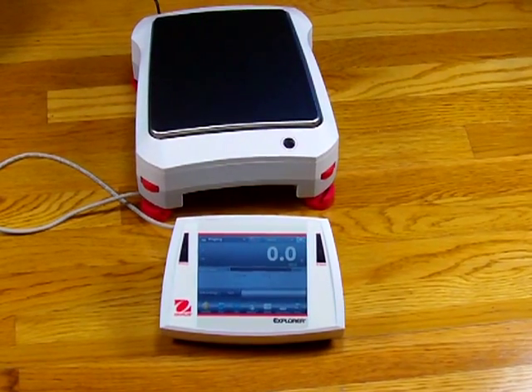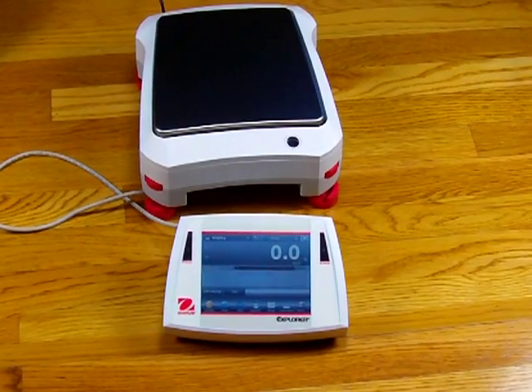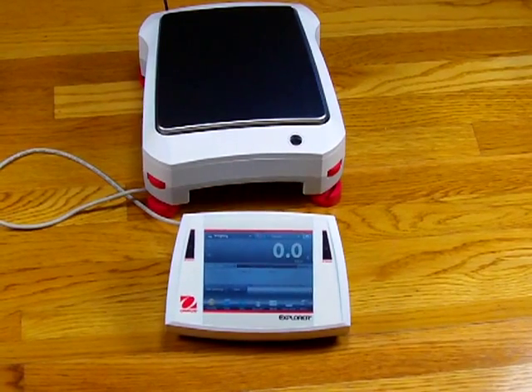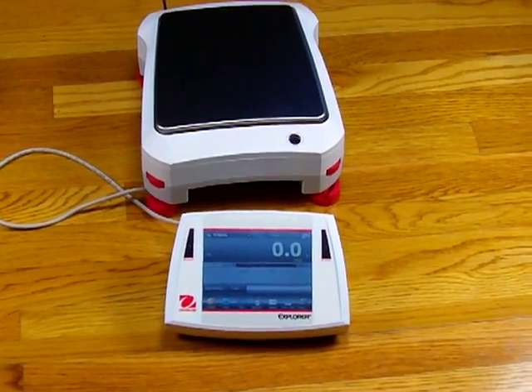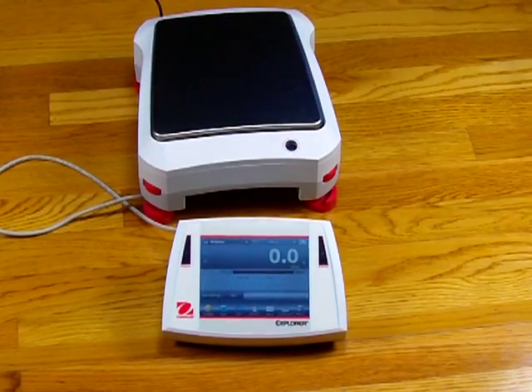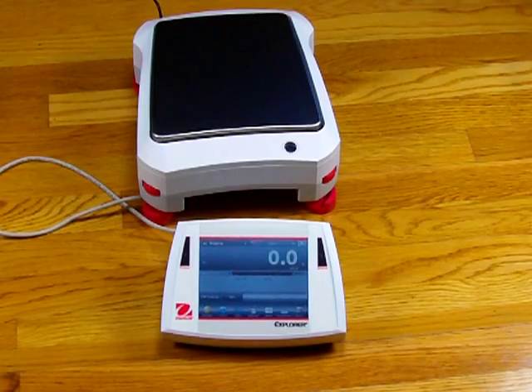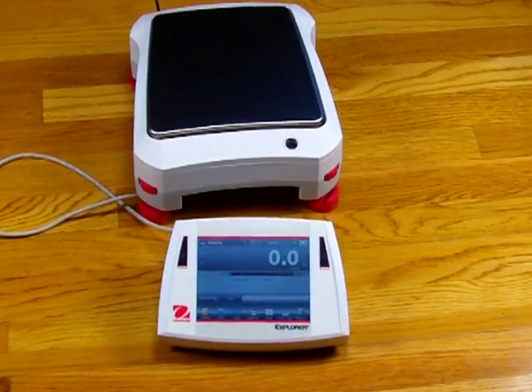Welcome to Balances.com. Today we'd like to show you the new Aarhus Explorer series. This is the newest balance from Aarhus Corporation for their laboratory line. This balance has about eight different models, going from analytical to precision balances. This model is the EX-6201 — 6,200 grams by a tenth of a gram. We'd like to talk about some of the features the balance has to offer.